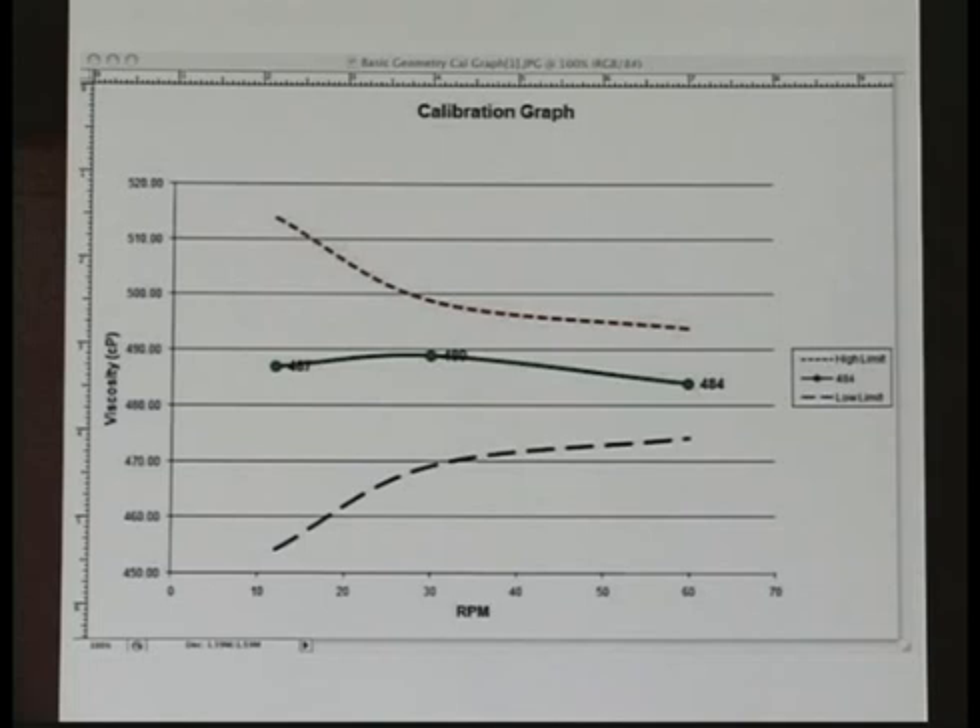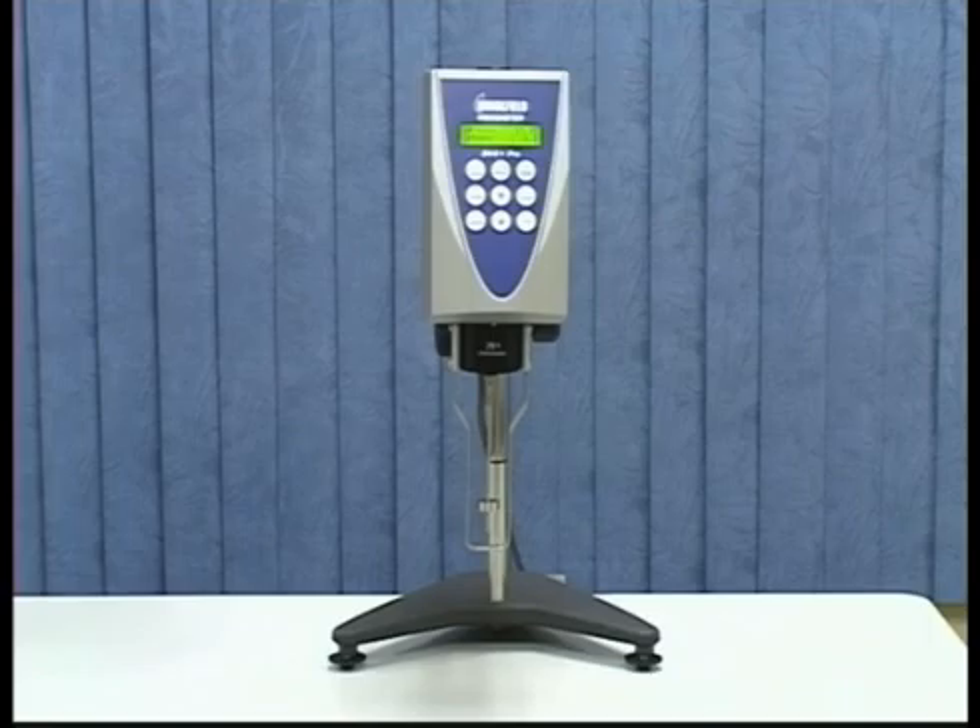You can see a graph of your results with this worksheet and the tolerances. Select the Calibration Graph tab to view the results. The data points are plotted and upper and lower tolerances shown. In this example, you can see the data points came within tolerance. And that's it — you have performed a calibration check.